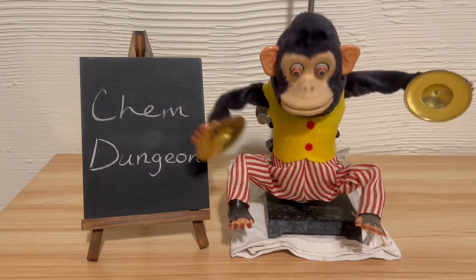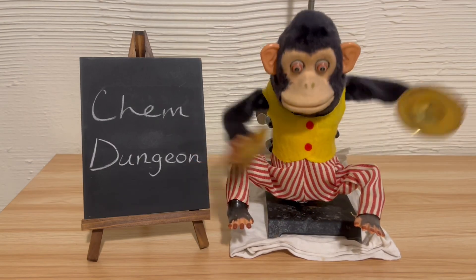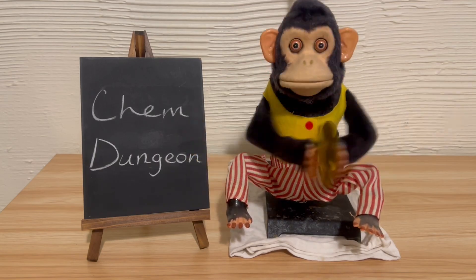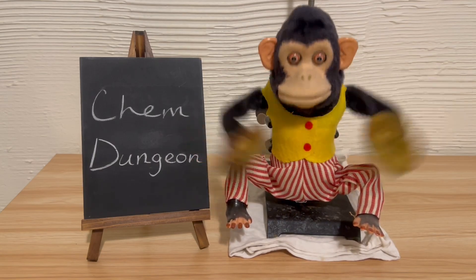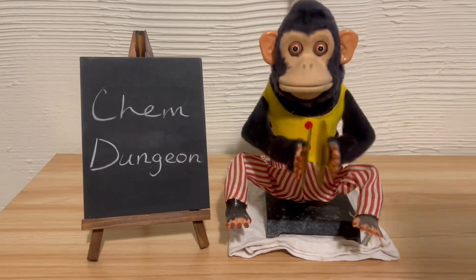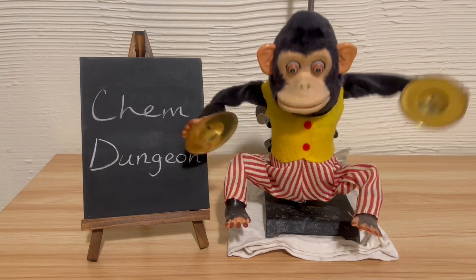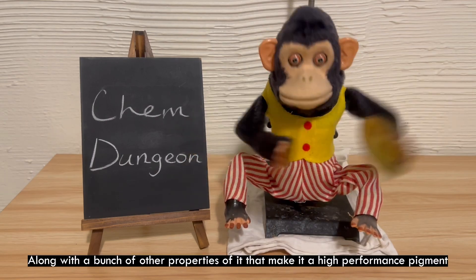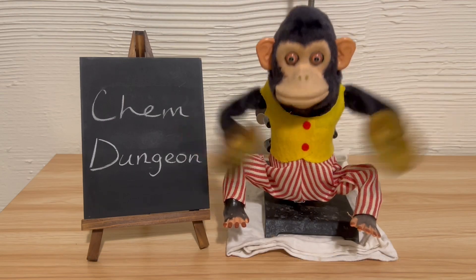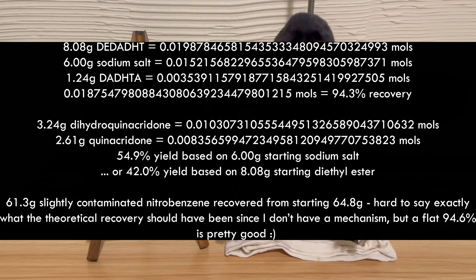There are alpha, beta, and gamma phases for the crystal structure, and I'll find out which one is needed for quinacridone gold. What I do know is that my melting point apparatus tops out at around 310 degrees, and this quinacridone isn't affected at all up to that temperature. This tracks with it having a melting point of 390 degrees. Such a high melting point makes quinacridone an extremely appealing pigment for coloring plastics that are thermally processed.